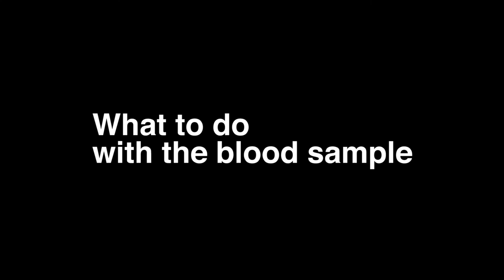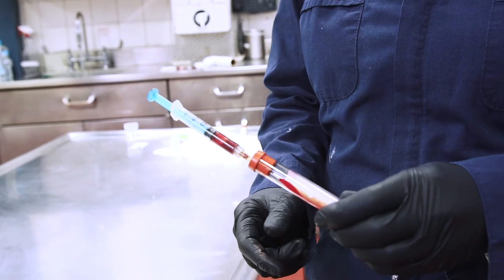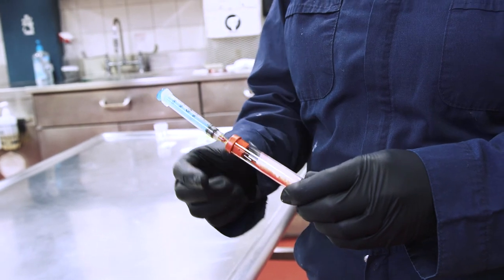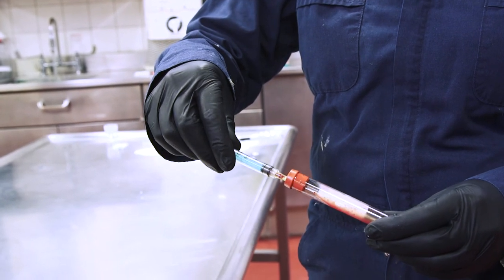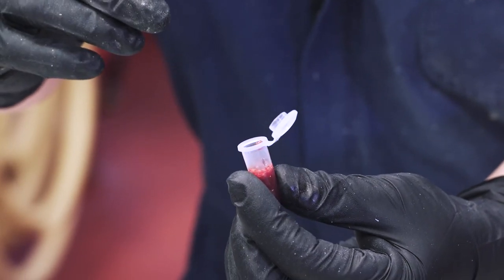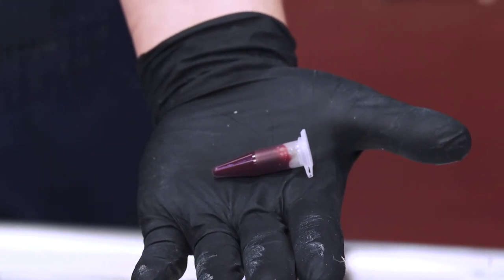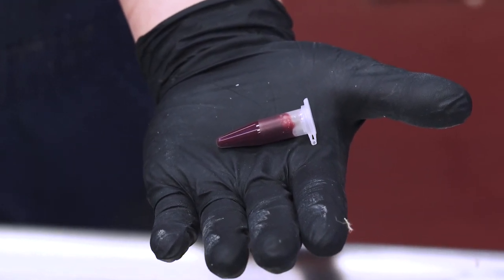Next, let's talk about what to do with the blood sample. It's important to transfer the blood from the syringe into the desired container, ideally before the blood has clotted. If using a red-topped clot tube with a vacuum, simply insert the needle into the tube and allow the vacuum to draw the blood inside. If the blood has already clotted, remove the needle from the syringe, then compress the syringe to express the blood. Fill the container one-half to three-quarters of the way full — don't fill it completely. Then lie it flat or at a slight angle to allow the blood to spread out on the bottom. This allows better separation between the clot and the serum and will result in higher serum yield.